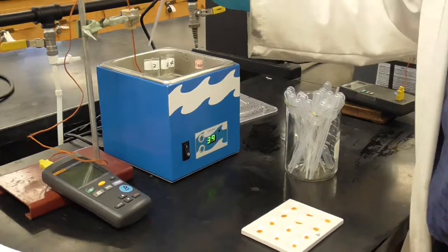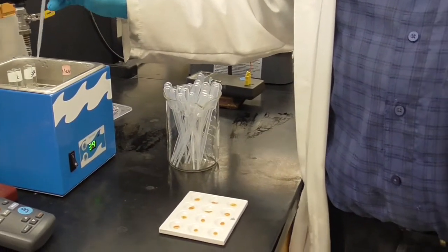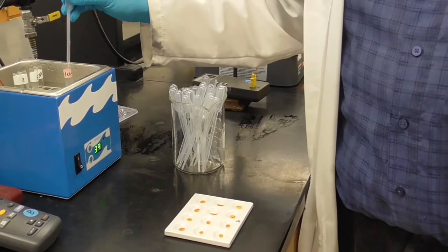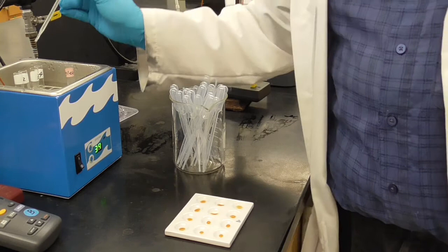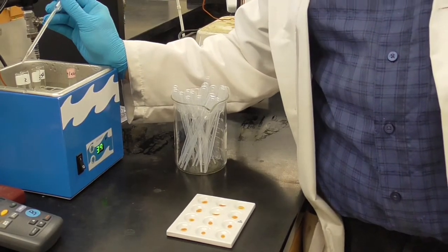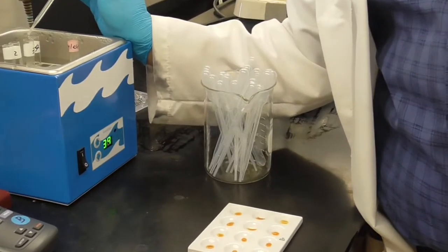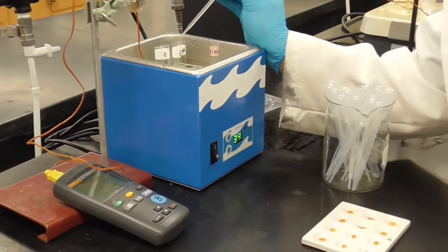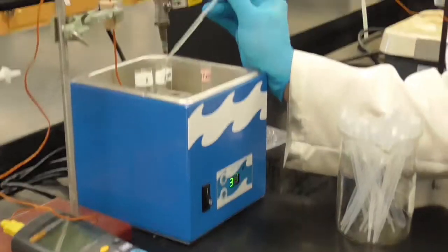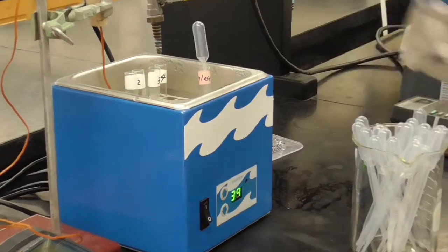Good. So again, 0 drops will go into this first one, then 2, 4, and 6. Here's my enzyme, the amylase. I'll draw some up into here. Nothing in the first tube. In the second tube, 2 drops. 1, 2, 4 drops here. 1, 2, 3, 4, and 6 drops here. 1, 2, 3, 4, 5, 6. I'm going to just leave that in there.